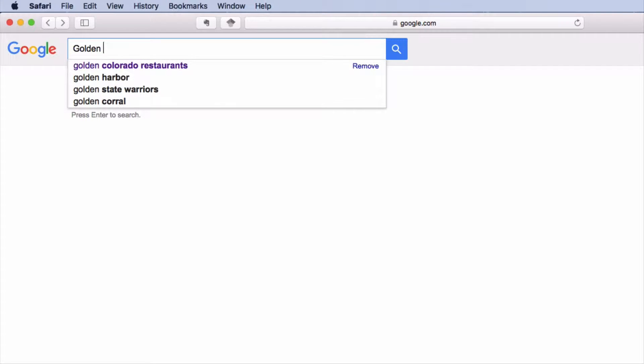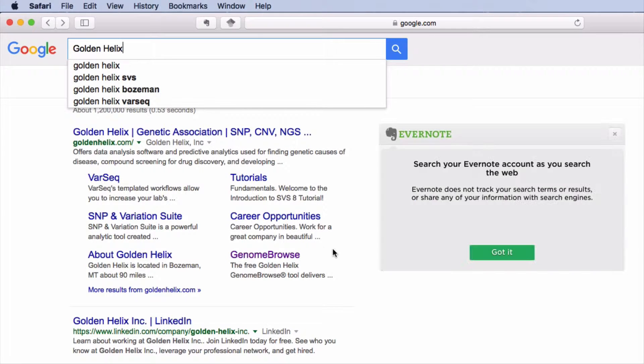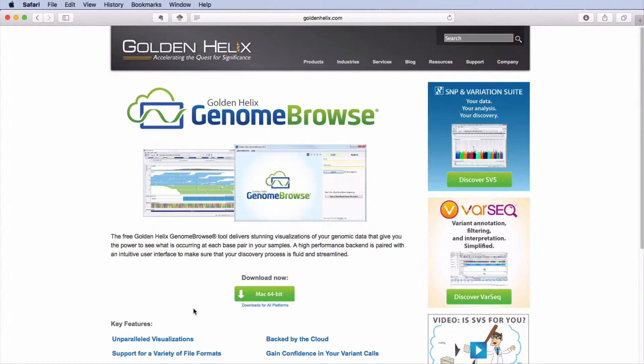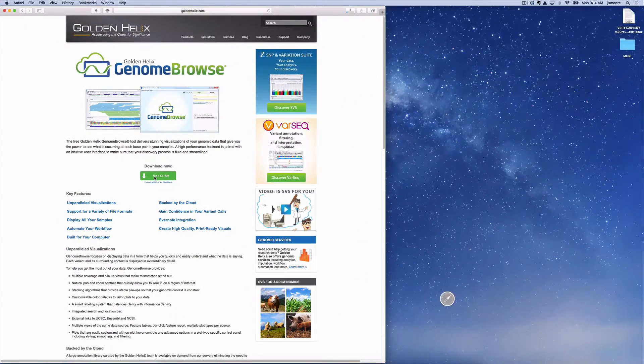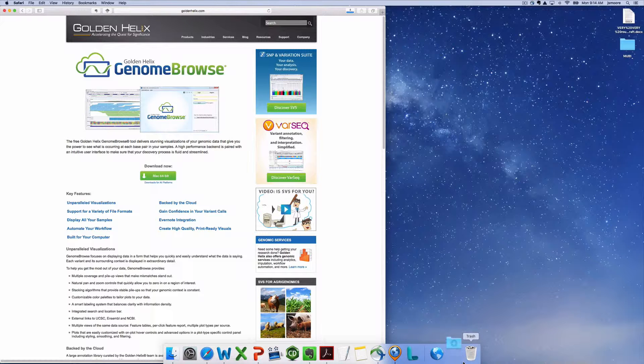Golden Helix is the software company that developed Genome Browse. Search for Golden Helix and click on Genome Browse. Download Genome Browse. Genome Browse is intended for research and education use only.